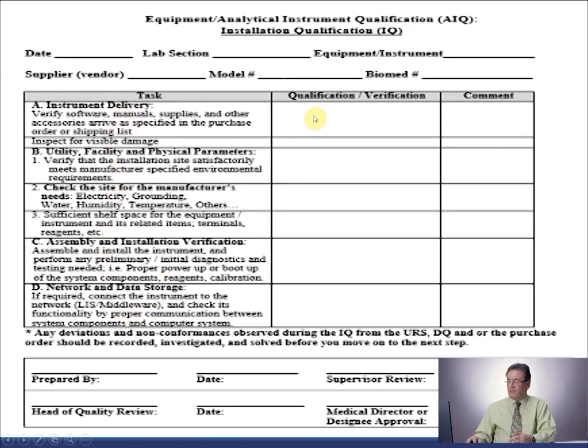It is important to have a uniform set of steps that will address all the stages of qualification like I described to you in these three lessons. These equipment and instrument qualification steps or stages are DQ, IQ, OQ, and PQ. Because the DQ, IQ, OQ, and PQ are performed separately, each should have its own set of verification steps like I showed and described to you.